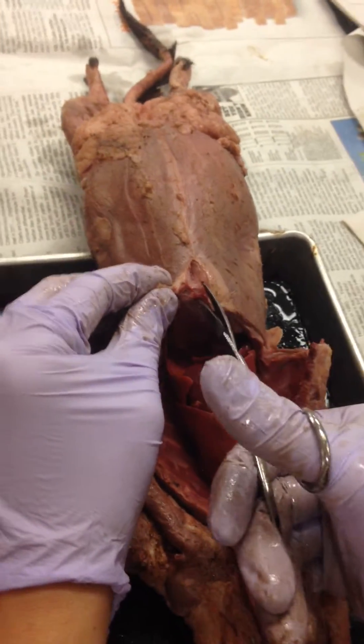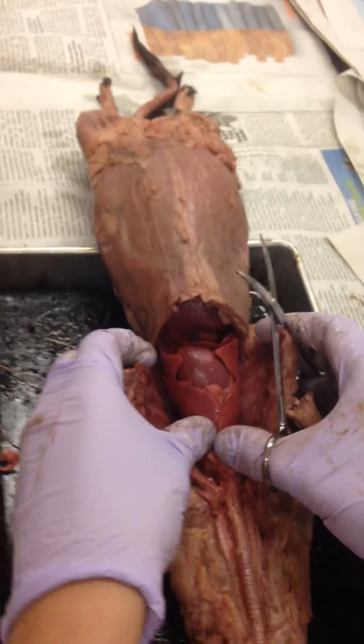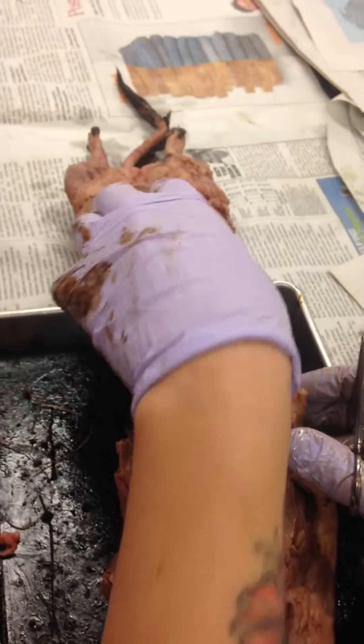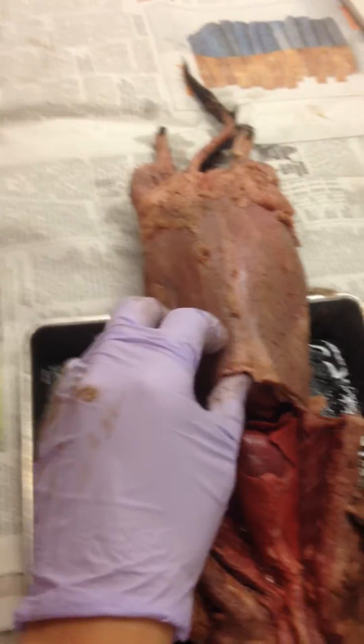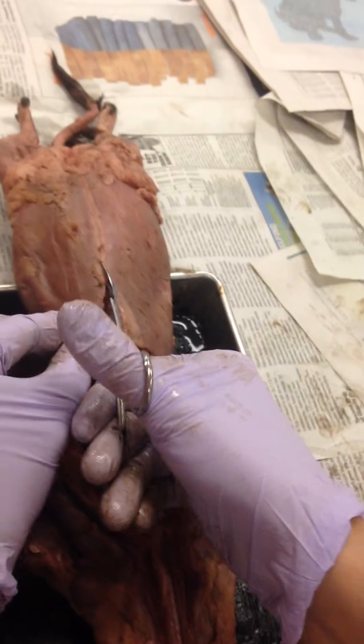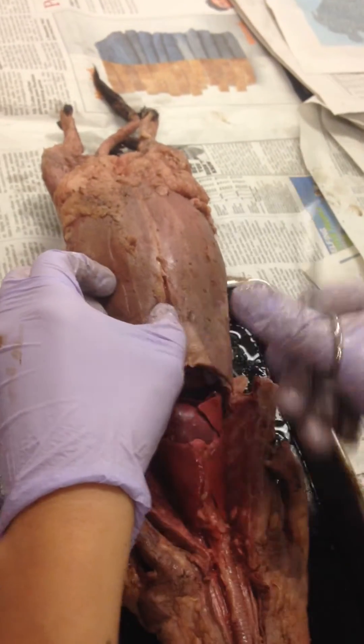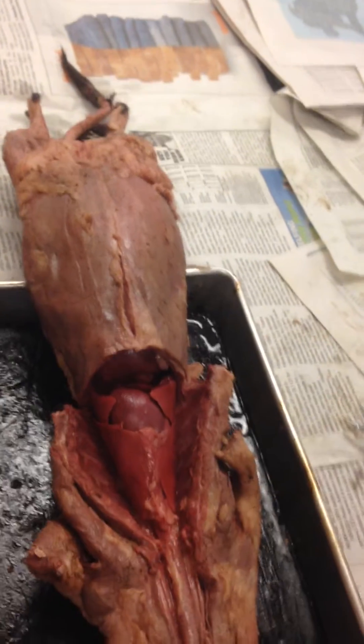You'll see there's some fat in there. This makes sense because there are ribs up here protecting these organs, but there isn't a whole lot of protection in terms of bones down here, so it makes sense to have fat as an extra layer of cushion instead of bone.